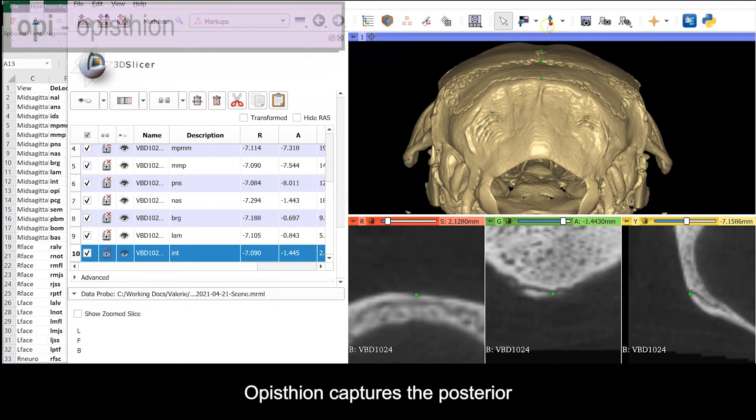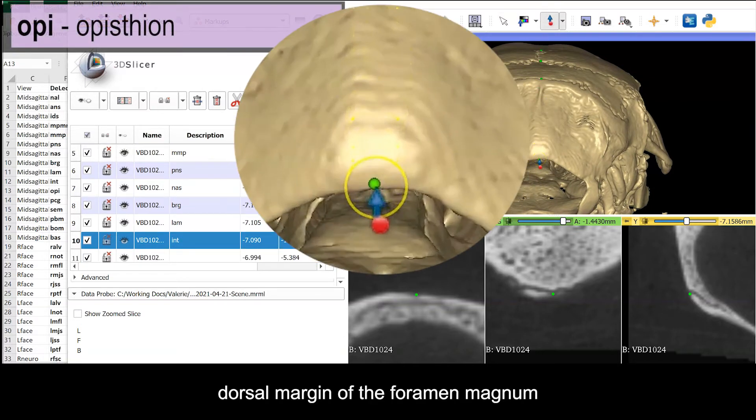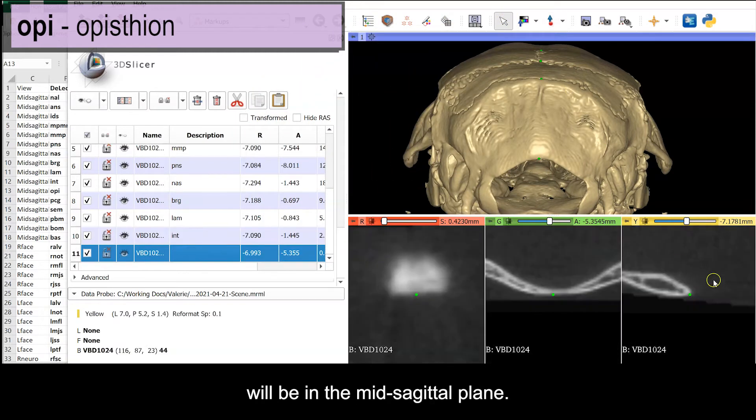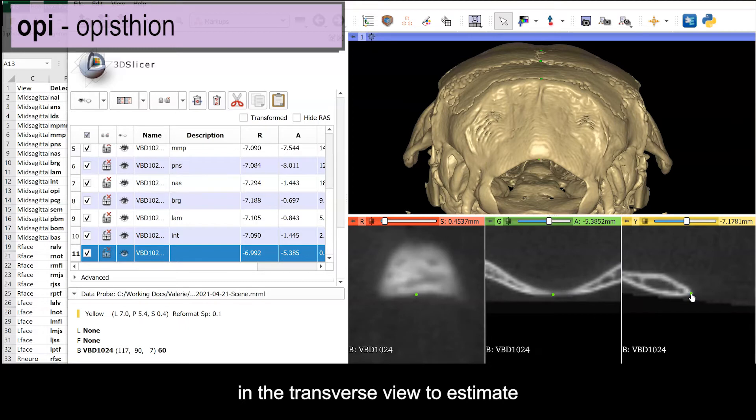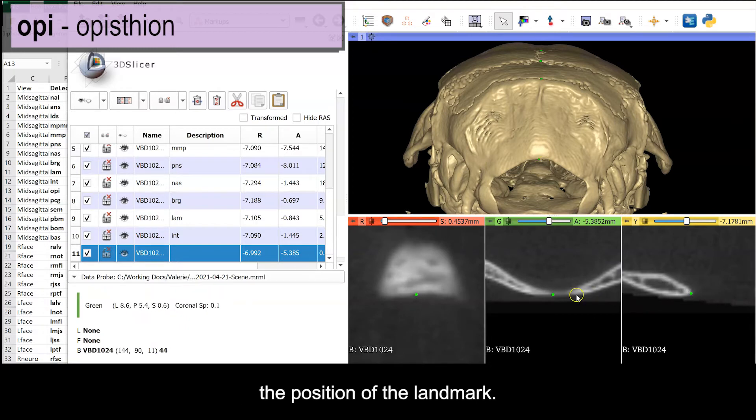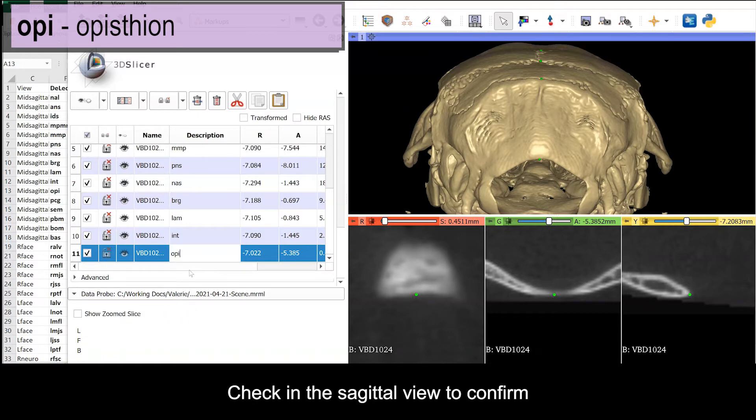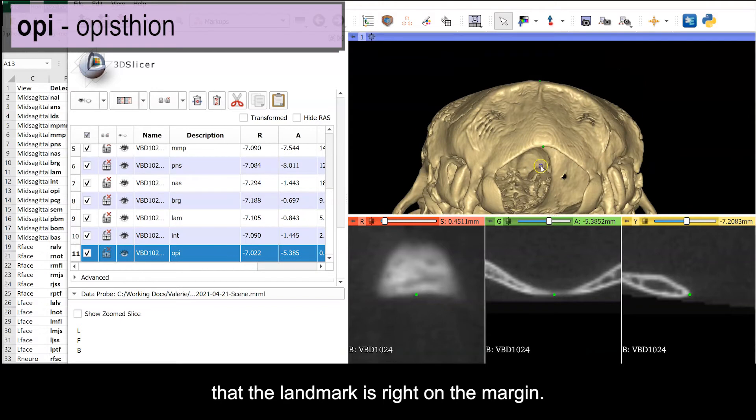Opisthion captures the posterior dorsal margin of the foramen magnum with an expectation that it will be in the mid-sagittal plane. You can use this radiolucent gap in the transverse view to estimate the position of the landmark. I also used the nuchal lines to help me find the midline. Check in the sagittal view to confirm that the landmark is right on the margin.